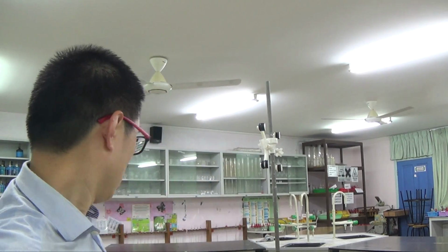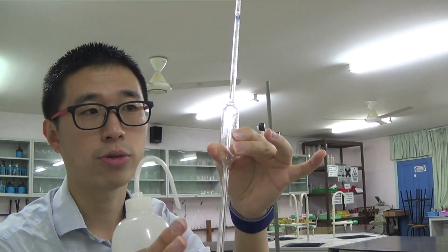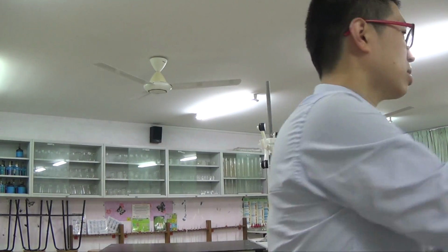Being a usual titration, I don't know what happened with the last person who used my apparatus, so I will rinse with distilled water. But whatever you do, you always have to rinse with the solution that you are going to fill it with eventually, before you start your titration, okay? So I'm just going to rinse my pipette.